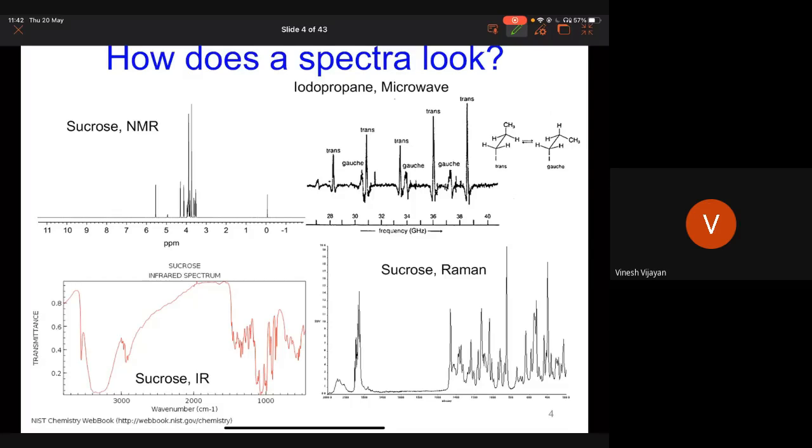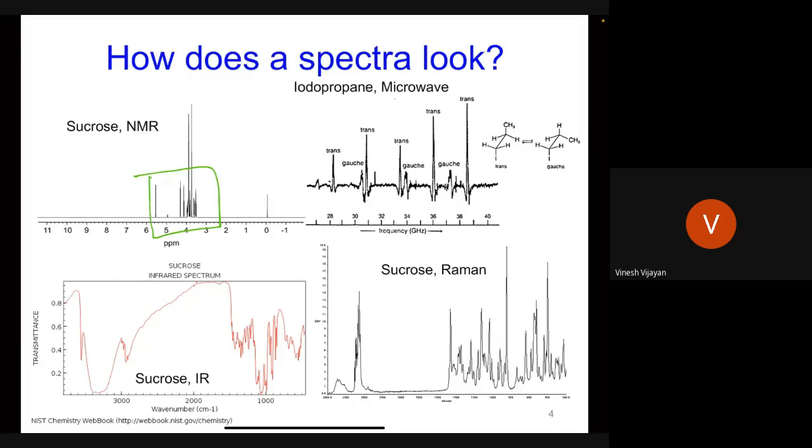So if you are able to see, although I only discussed the sucrose signal, you have something like a reference that is present. Generally, for small organic molecules, you end up using something called tetramethylsilane. And for water soluble, you use something called TSP. And this helps you find what is the zero frequency. So this is what gives you the reference frequency that you would like to measure.